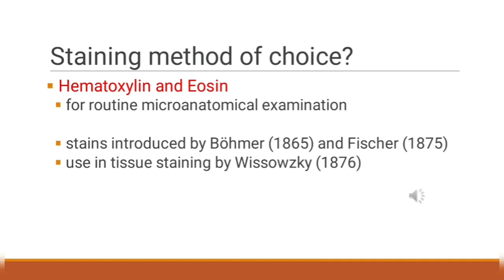Eosin is strongly absorbed by the red blood cells, coloring them bright red. In a skillfully made H&E preparation, the red blood cells are almost orange, and collagen and cytoplasm, especially the muscle, acquire different shades of pink. When the staining is done by a machine, the subtle differences in eosinophilia are often lost.